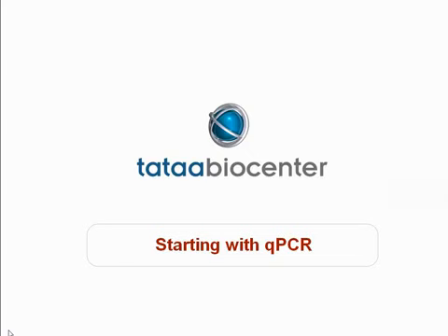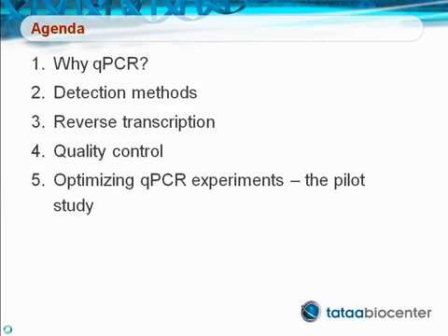Starting with qPCR. We start this session by comparing quantitative real-time PCR with legacy PCR. We then discuss the detection methods that are available, reverse transcription, which is needed in RNA analysis to convert the RNA to complementary DNA, quality control, and we end up with optimizing the qPCR experiments.